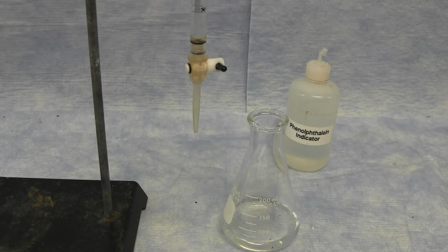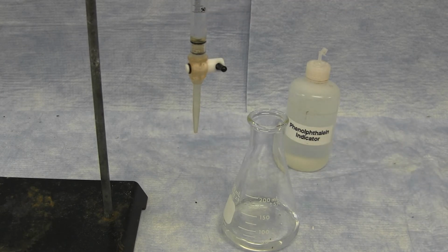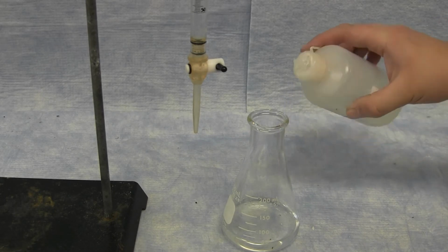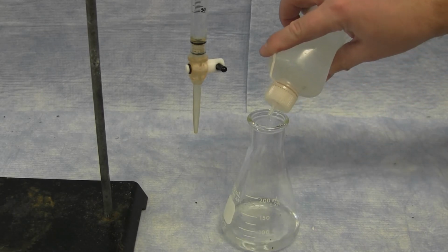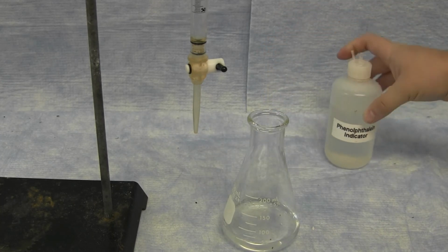To begin the titration, you will fill the burette with the standardized 0.1 molar sodium hydroxide solution. The concentration of this solution is known to 4 significant figures, so please be sure to record the correct concentration given on the sodium hydroxide container. You will add about 5 to 10 drops of phenolphthalein indicator to the flask.